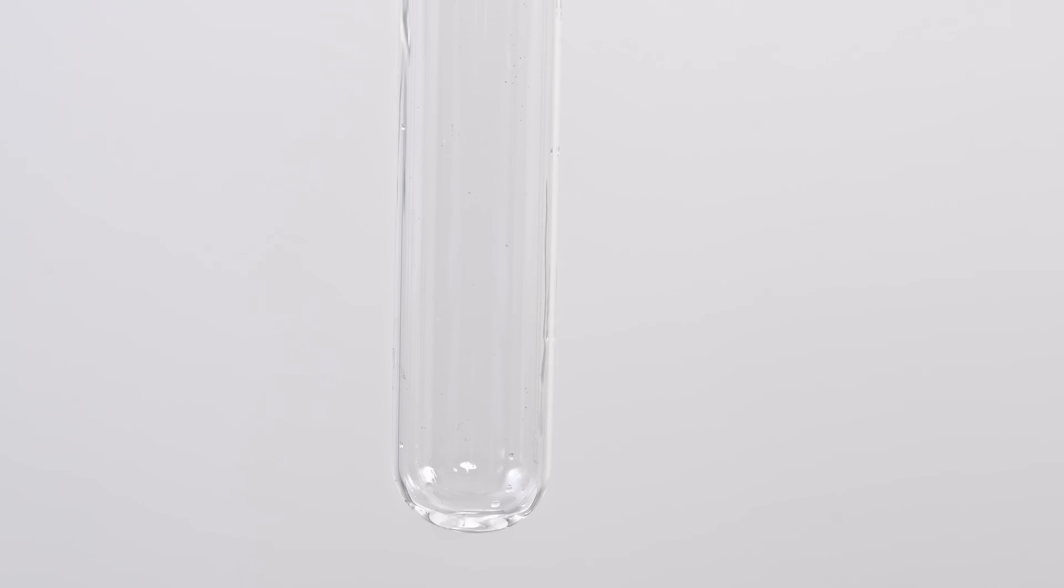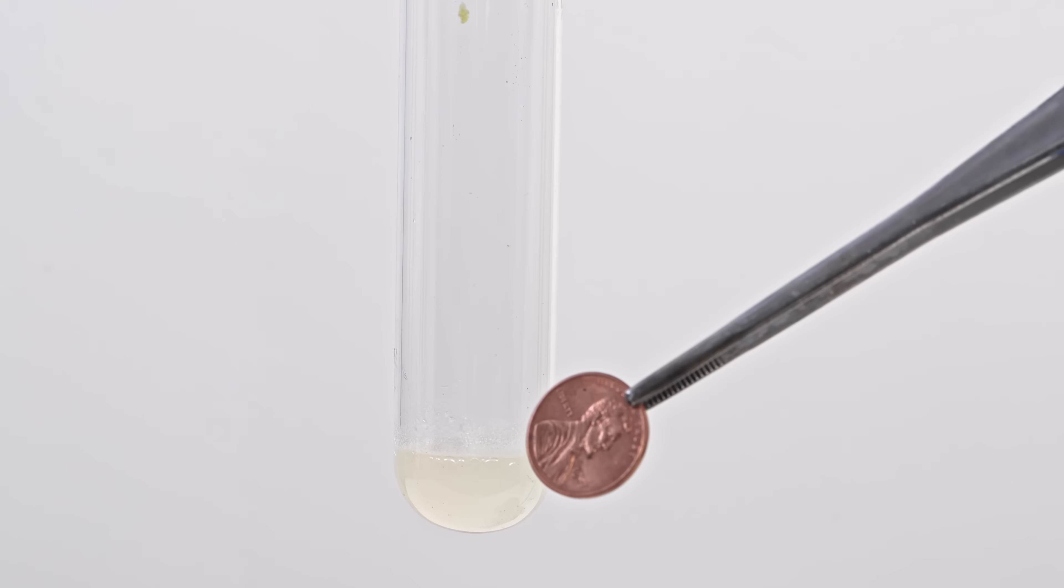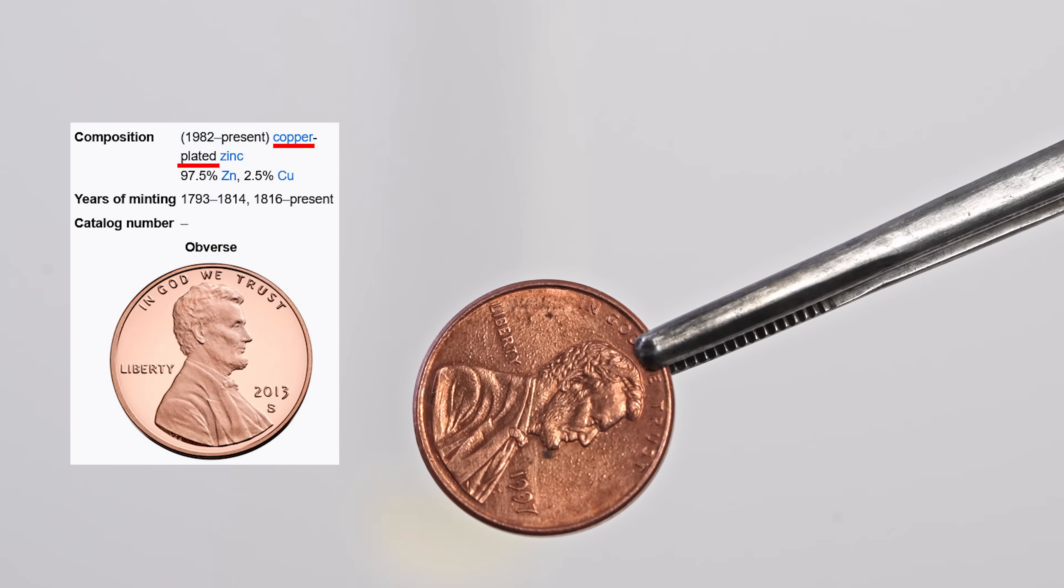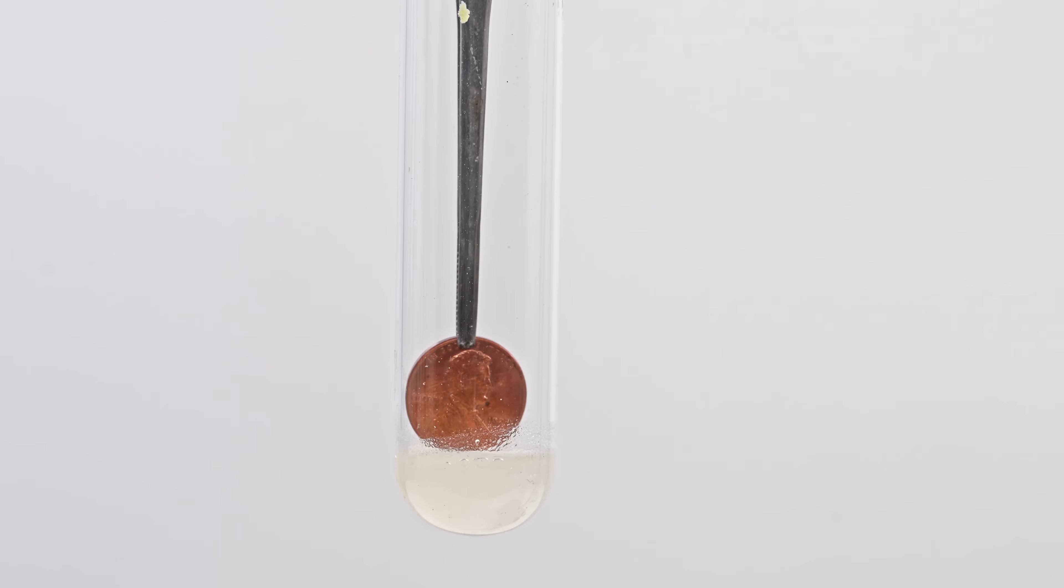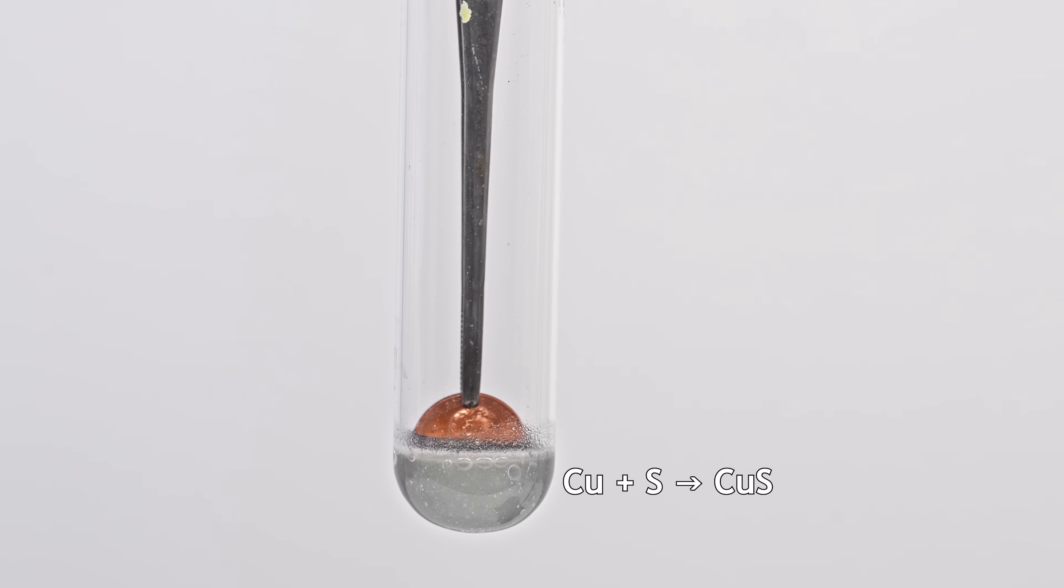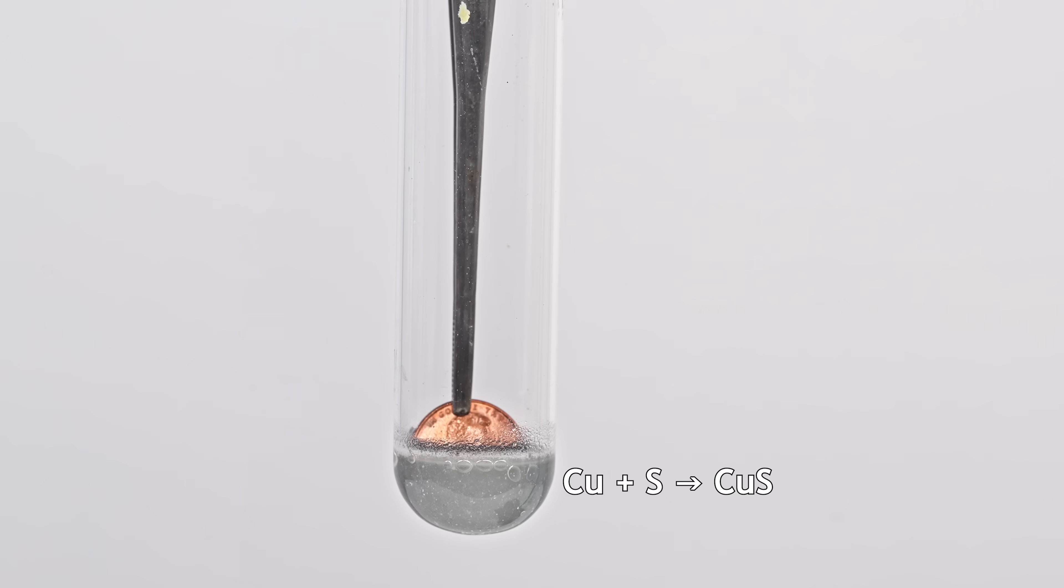The experiment with copper coin is based on this property of copper sulfide dissolution in the presence of cyanide ions. To obtain copper sulfide on the surface of the coin, I prepared a solution of sulfur and carbon disulfide. Sulfur dissolves very well in it. Then I took a copper coin, or rather this coin consists of zinc, simply coated with copper, and dipped the coin in a solution of sulfur and carbon disulfide. In this solution, copper quickly turns black due to the formation of black copper sulfide on its surface.